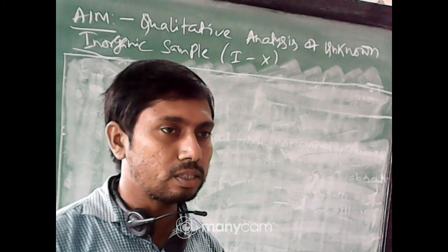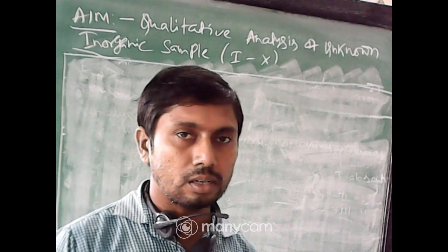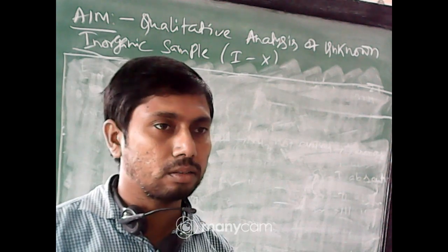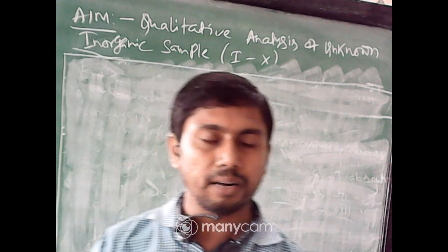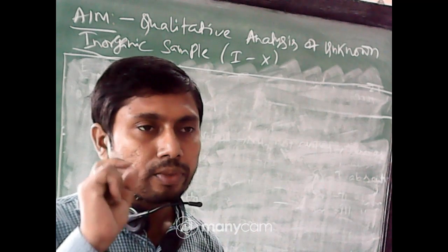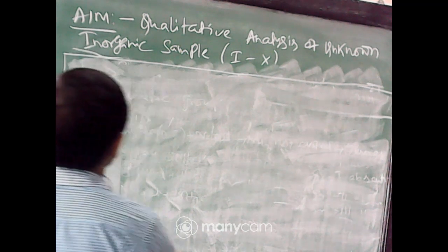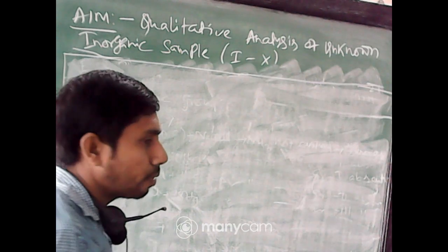Now the first question is: what is qualitative inorganic analysis? Today's part basically depends on theory, about the detailed analysis and the experiments you have to perform regarding that analysis. At first I will give you the introduction to this. Theory means related to the practical. So this is qualitative inorganic analysis, or qualitative analysis of inorganic salt.